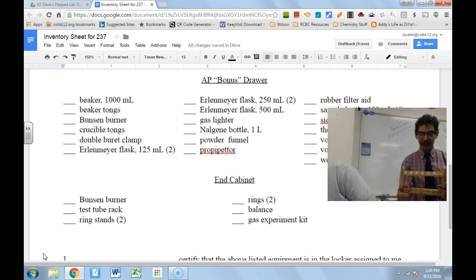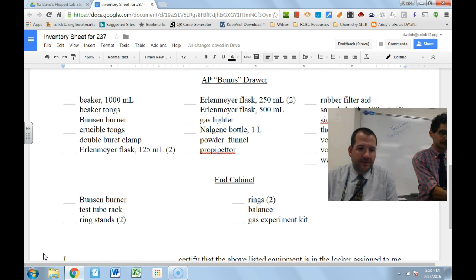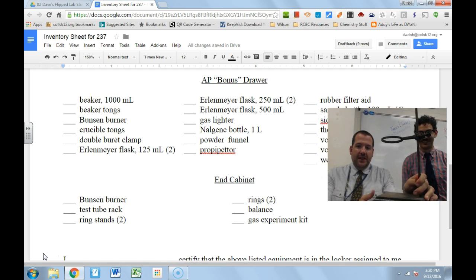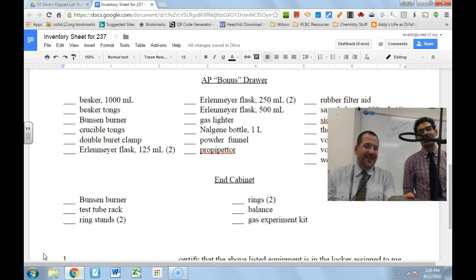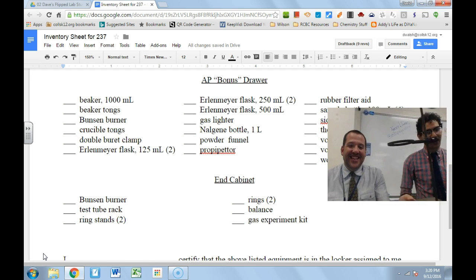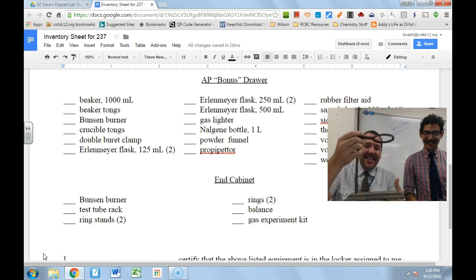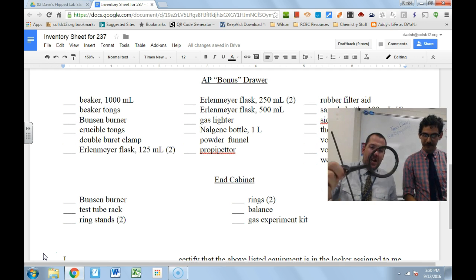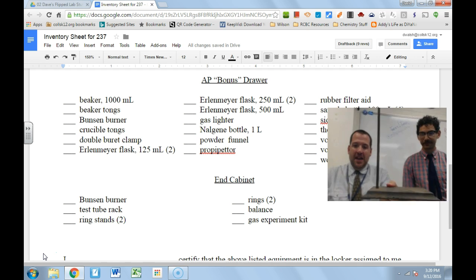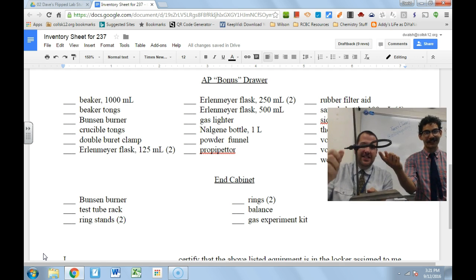This is a test tube rack — it holds all your test tubes nicely inside the holes. And then there is this guy, which is actually two things in one. You have a ring here, which is removable, and you can also put your burette clamp on it. And then you have the ring stand, which holds the ring. Make sure the stuff in the ring doesn't fall over or fall through — the wire gauze goes really nicely on it.